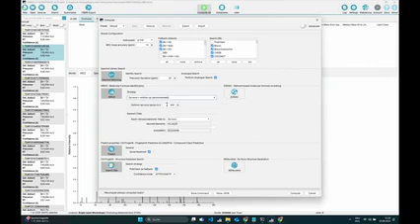One setting here which is important is that this mass indicates below which mass the de novo part will be turned on. Below this mass, we will use de novo, and beyond that, only bottom-up search, because de novo can result in large runtimes.